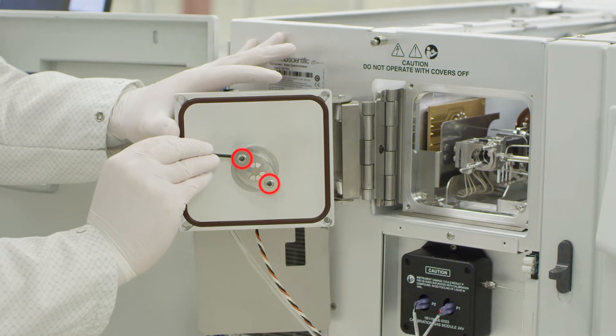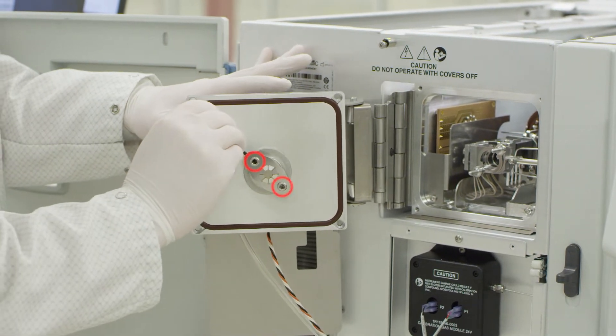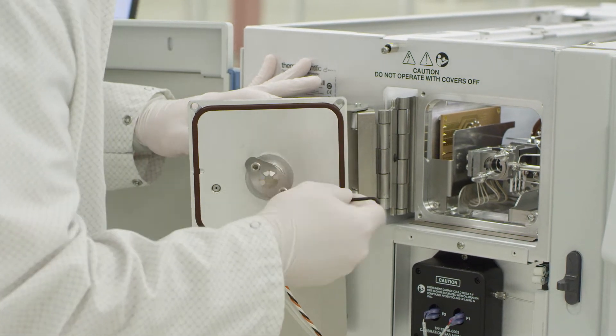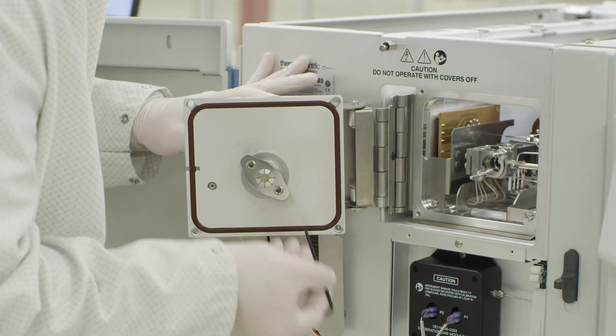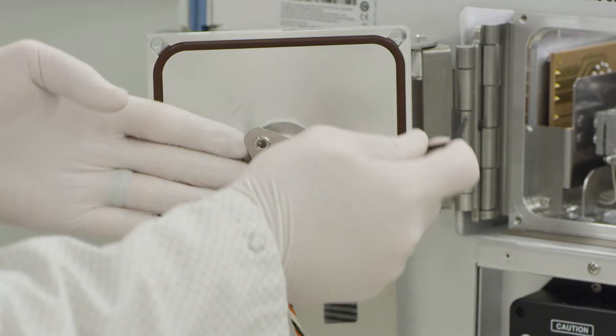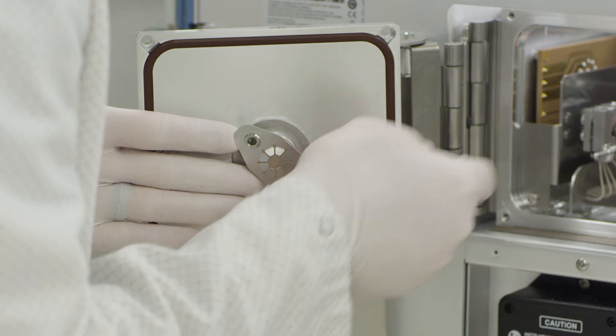Tighten the sockets from the side with an L-shaped tool. Caution, these are strong magnets. Keep at least 6 inches or 15 centimeters away from sensitive electronics and medical devices. Make sure the sockets are snug, but be careful not to over-tighten.